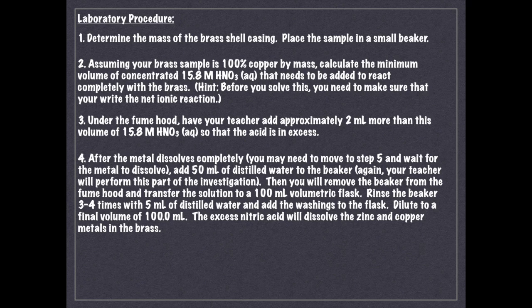So this is what you're going to do after we've created the Beer's law curve, after you've given the nitric acid the opportunity to dissolve away your shell casing. Now, the reason why I didn't show this is that I want this to be a surprise. I want you guys to see what it looks like. So you just have to follow the instructions, and it's pretty simple.